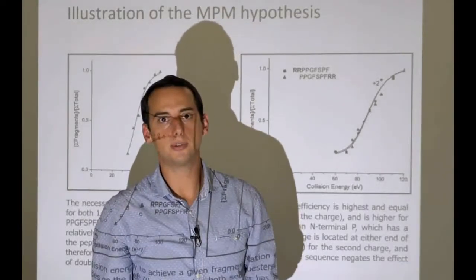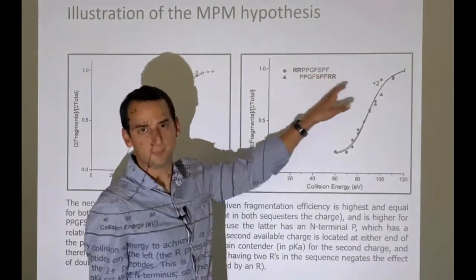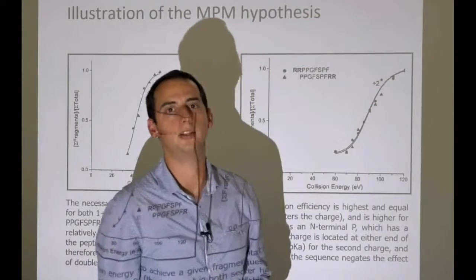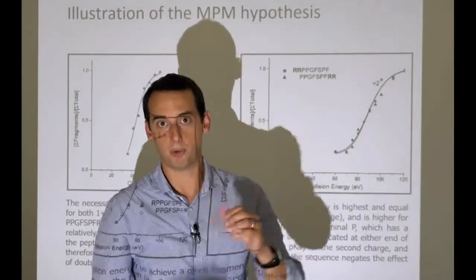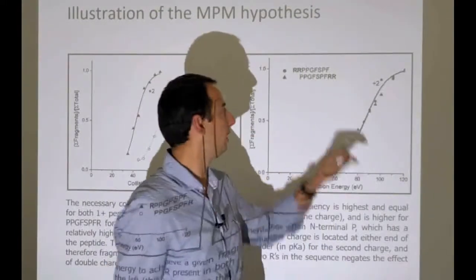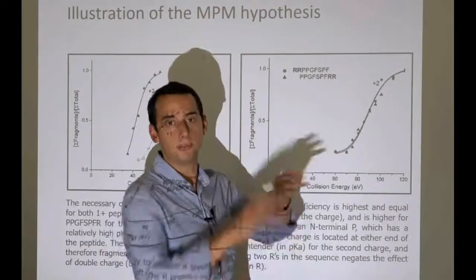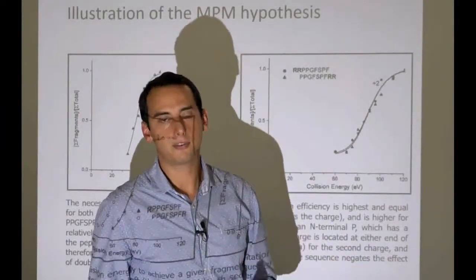Another thing that you can notice is strange patterns when you have an internal lysine, a missed cleavage, or an internal arginine. That too will localize the charge, and you will see a very prominent break, a very strong signal for the fragment right adjacent to the internal arginine or lysine, and you will see fewer fragments outside of that range. These kinds of things are very typical.